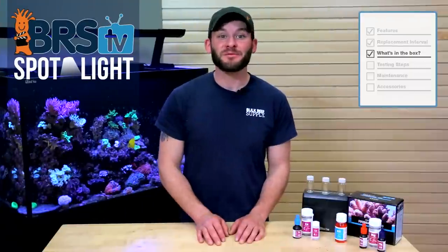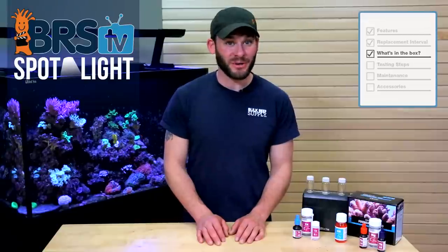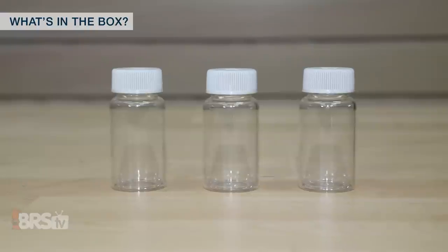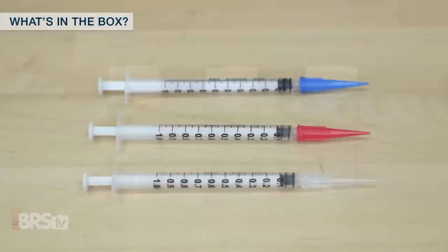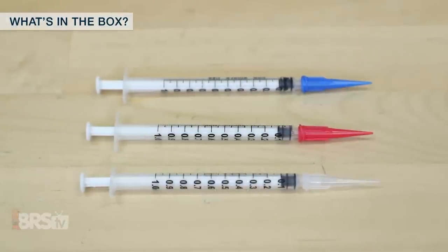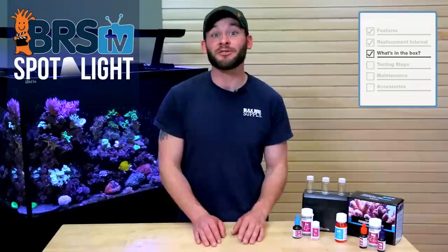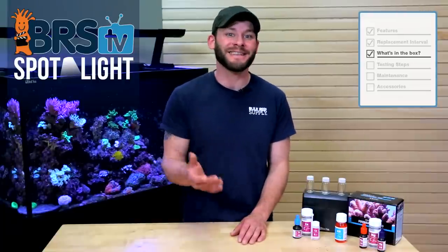Let's talk about what comes with the Red Sea Multi Foundation Pro test kit, starting with the hard shell protective case, which also houses three analytical grade glass vials with lids. You'll get three one-milliliter graduated syringes, each with their own application tip in red, blue, and clear, to maintain testing integrity and reduce potential cross-contamination between the three tests.